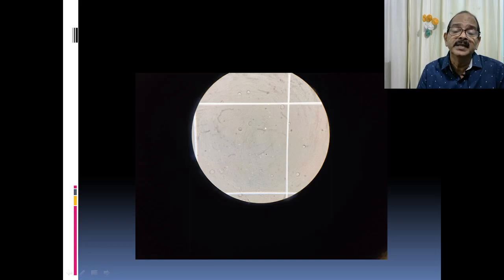What happens is the initial sample will have nucleated cells—lymphocytes or neutrophils can be identified. After some days, they become pus cells. These are the cells focused in high power, and this is what we should be doing.